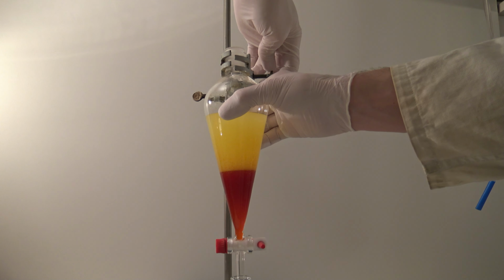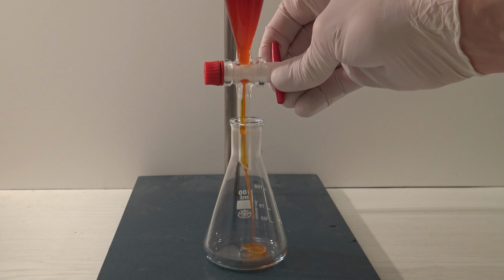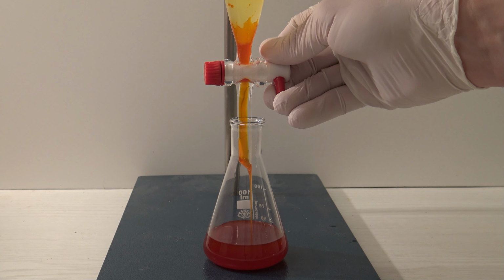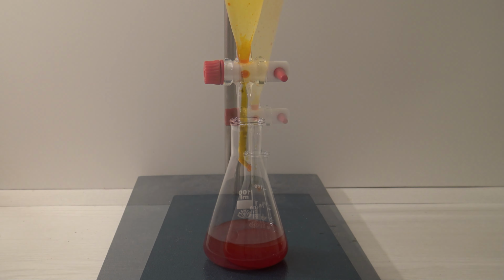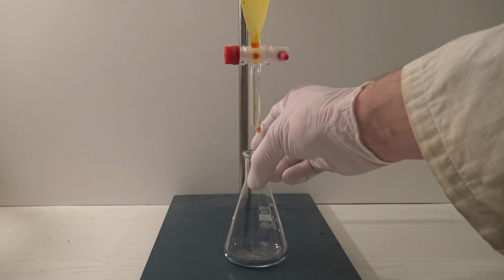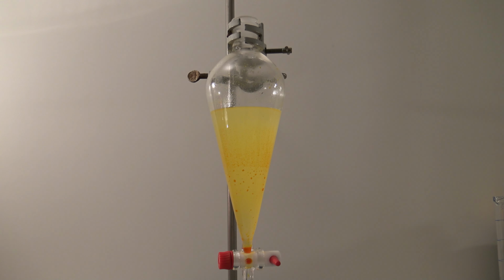After that, the organic layer was added to an Erlenmeyer flask. It was opaque due to traces of water, which was not a problem because it was going to be dried later on. The flask was set aside and replaced by an empty one. The watery layer was extracted with diethyl ether.